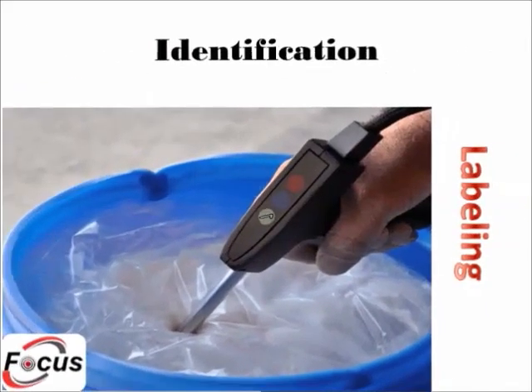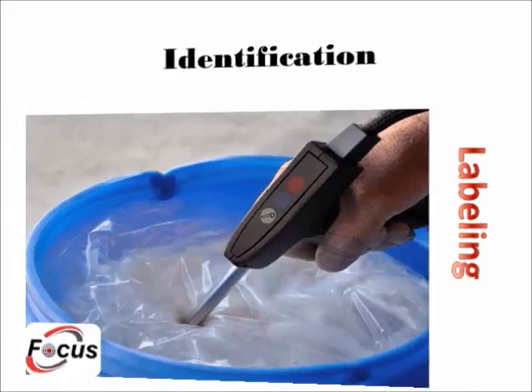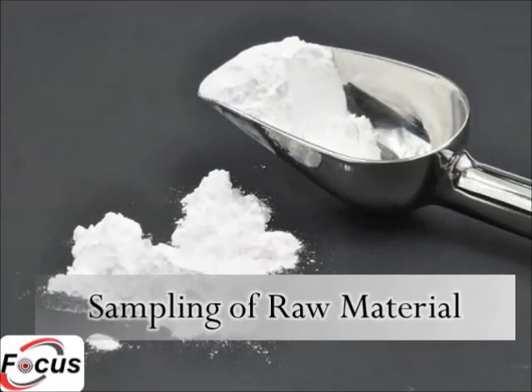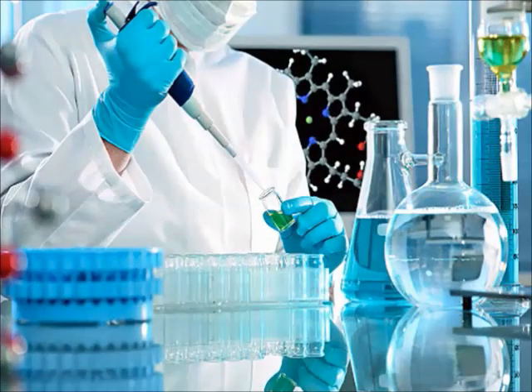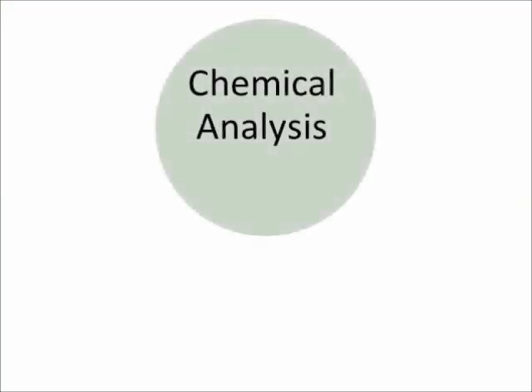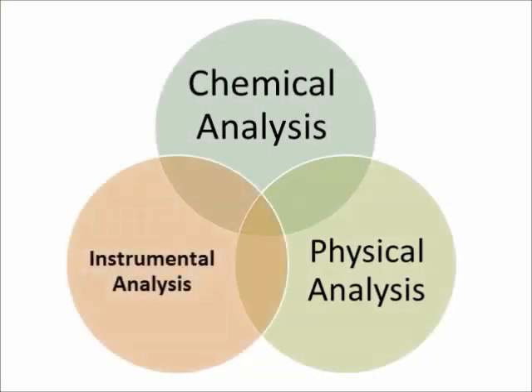After the receiving of raw material at the factory, the raw material container will be identified and labeled in the warehouse before analyzing it. After that, quality control takes a sample for analysis to ensure its quality. Quality control analysts analyze samples to assure that they meet the specifications and are valid to be used in the manufacturing process. This analysis is categorized into chemical analysis, physical analysis and instrumental analysis.